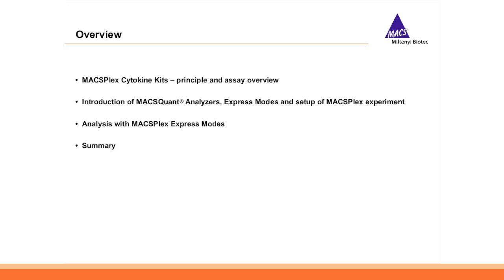First, I will give you some details on our MACSPlex Cytokine Kits concerning the principle and the assay overview. Second, I will introduce our MACSQuant Analyzers, the Express Modes, and the setup of a MACSPlex experiment. Third, I will tell you something about the analysis with our MACSPlex Express Modes. And finally, I will give a short summary. After the second and the third part, I will also show the setup of the experiment and the analysis in our software.